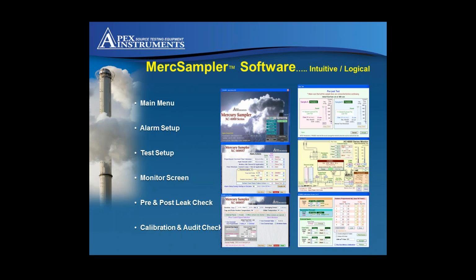On the right-hand side of that screen, you have a choice of whether you're going to give it a moisture signal. Now, you can give it a fixed value, and that's probably the more common process. But some plants do have a moisture monitor, and they will provide a moisture signal. And again, you've got options there. You can do 4 to 20, 1 to 10 volts, or via Modbus. And you choose your flow rate also on this screen.